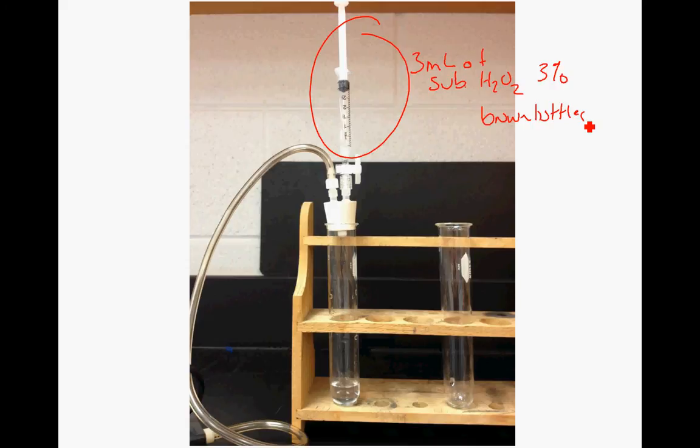So the substrate, the peroxide, goes in the syringe. This is the stopcock valve here. I'll talk about that in just a second. We had some issues with that. This tubing right here is hooked up to the pressure sensor. So this goes to the pressure sensor, which is hooked up to the computer, right? We had some groups screw up which end they were putting the syringe on top of here. I don't know what happened there, but just make sure you have that figured out.